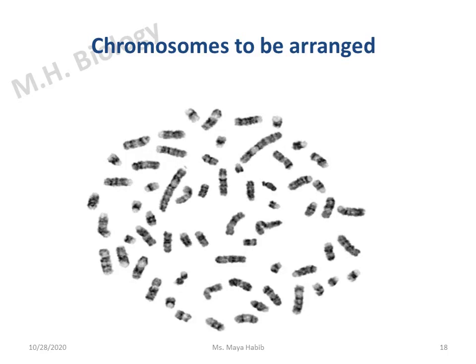Here is a video showing you the karyotyping procedure, done in the laboratory. This is how the photograph of the chromosomes looks like during metaphase. Now, we are going to arrange them according to certain criteria as shown in the next slide.